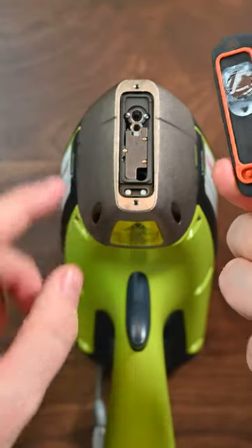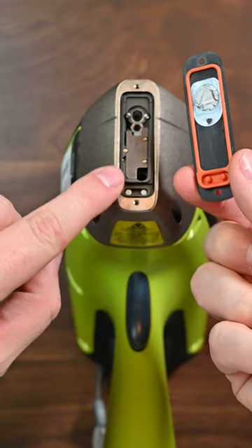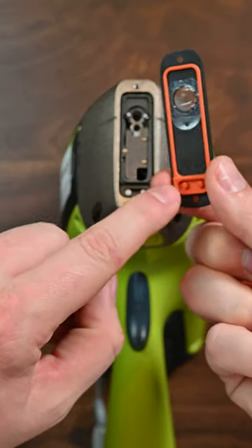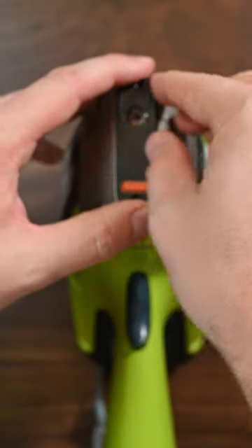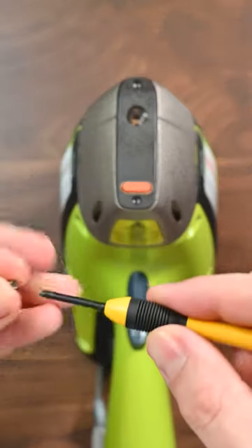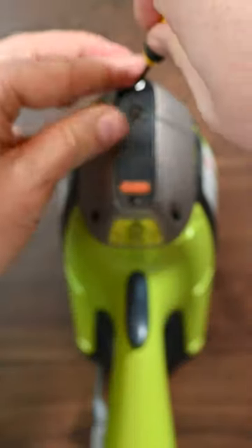When you put the face plate back on, make sure you're paying attention — there are these two little nubs that correspond to the bottom. There's an orientation on the face plate. Once that's back on the front, just screw it back together.